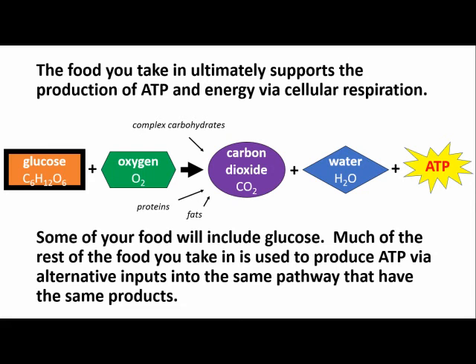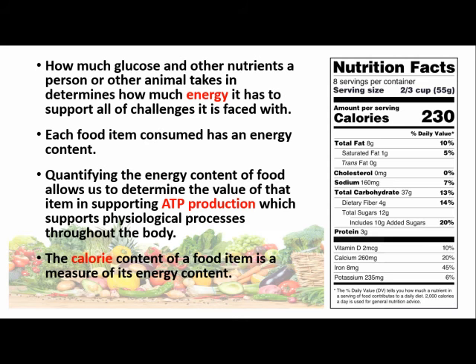So we're going to complete this lab today and start looking at what happens when we put other forms of macromolecules into this metabolic system. Now, how much glucose and other nutrients that a person or an animal takes in actually determines how much energy it has to support all of the challenges that it's faced with.